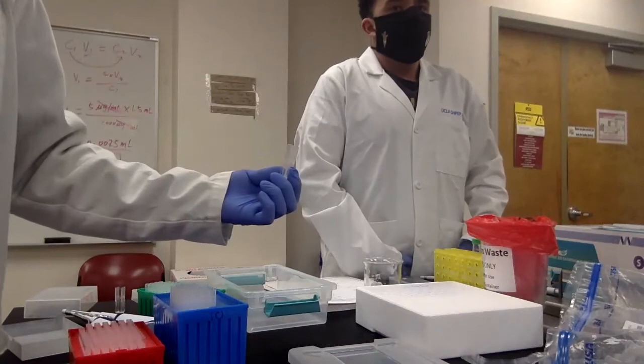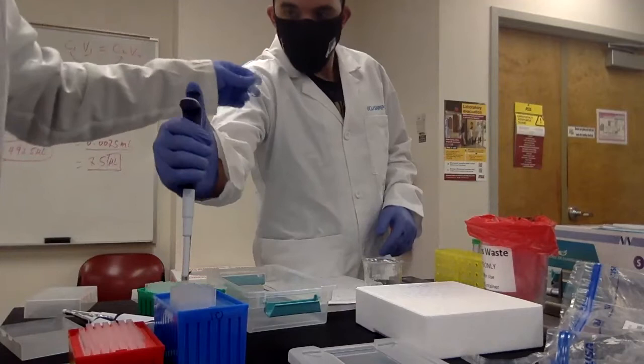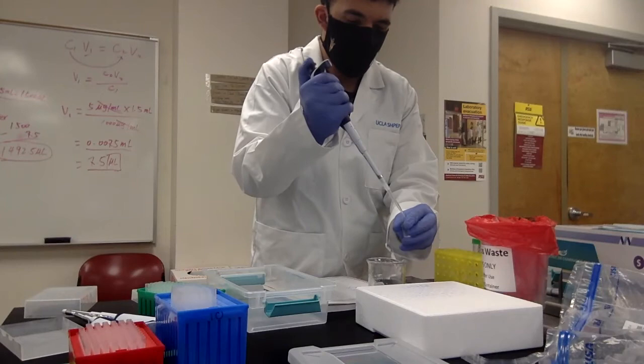Okay, so do I put water in the cuvette? Yes, you need water in this cuvette. That will be your blank sample. How much? I would say 1.5. Just make sure it's full enough. Yes, one more. That will be good. Okay, should be fine.